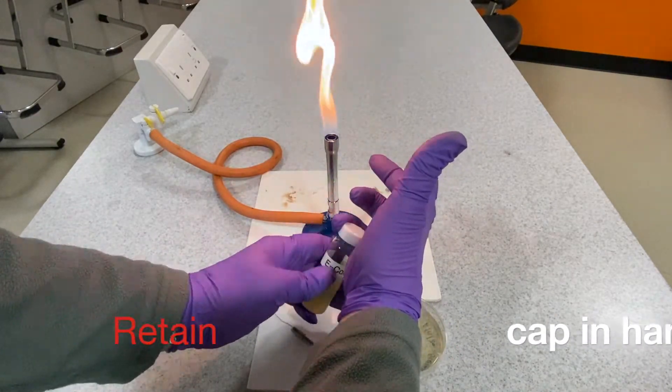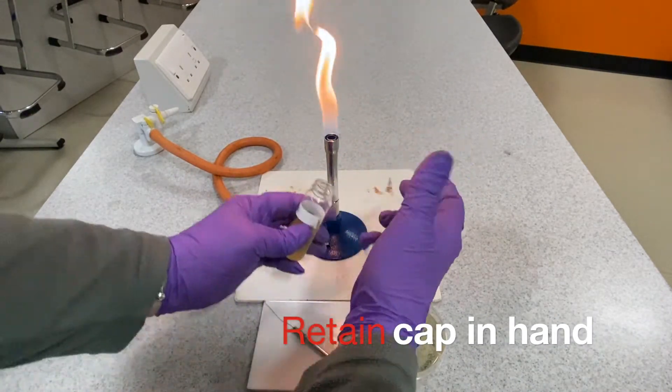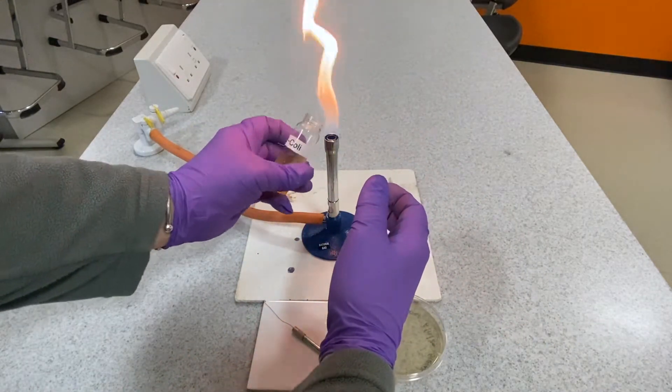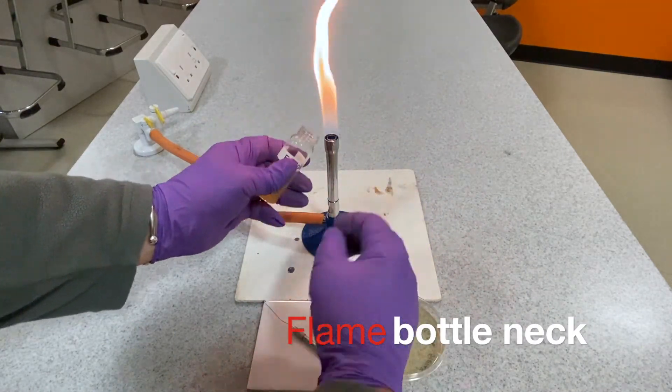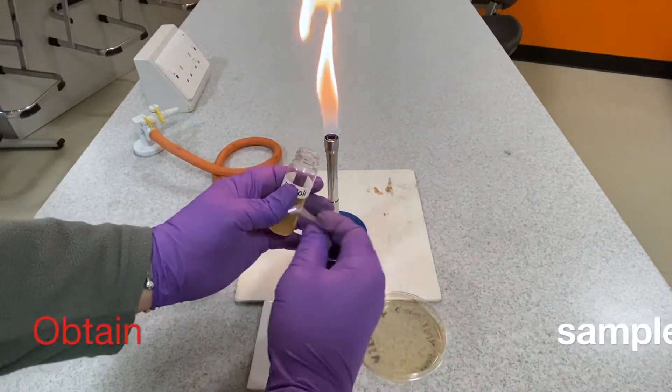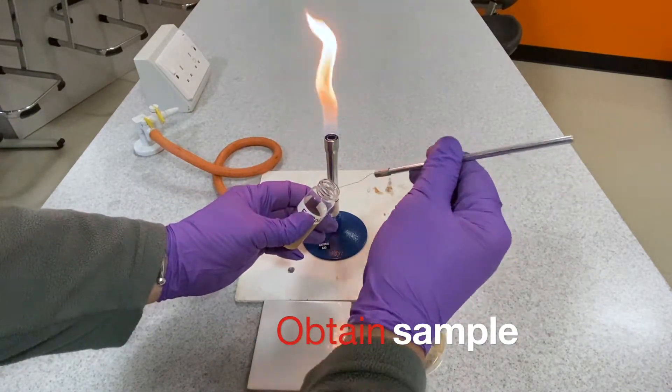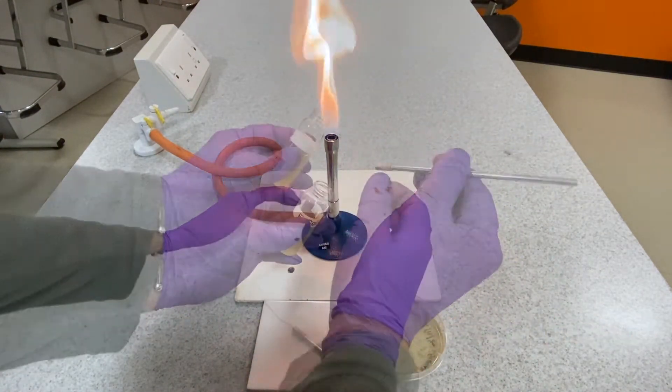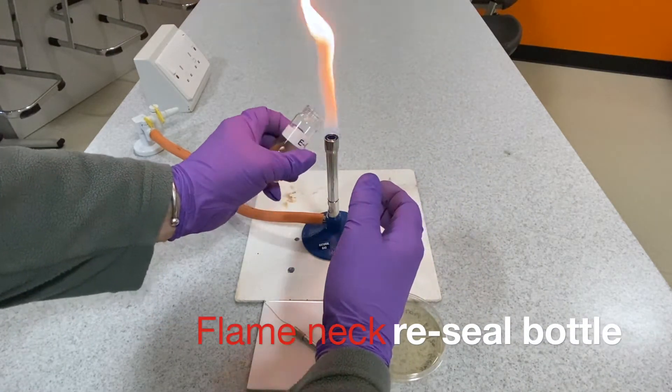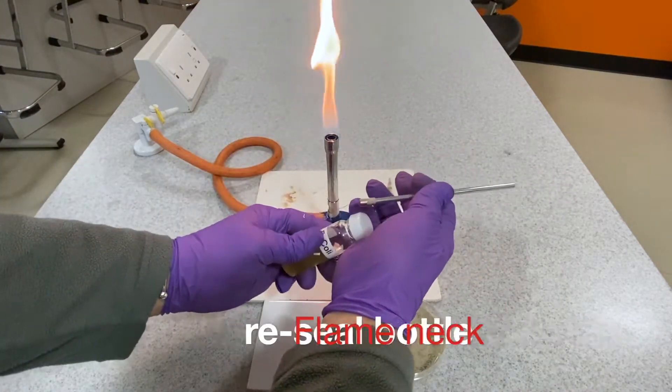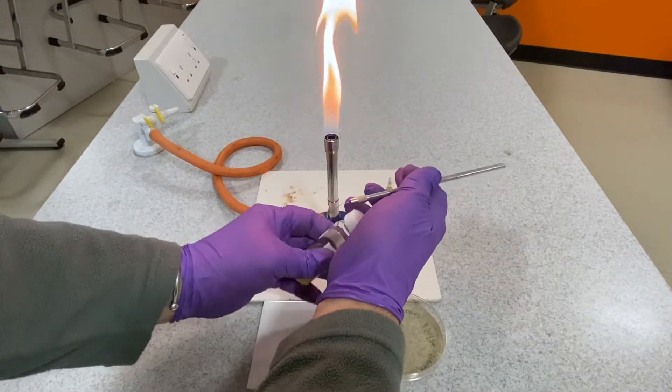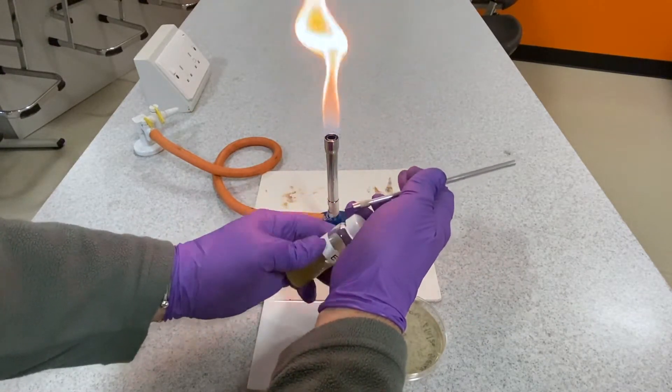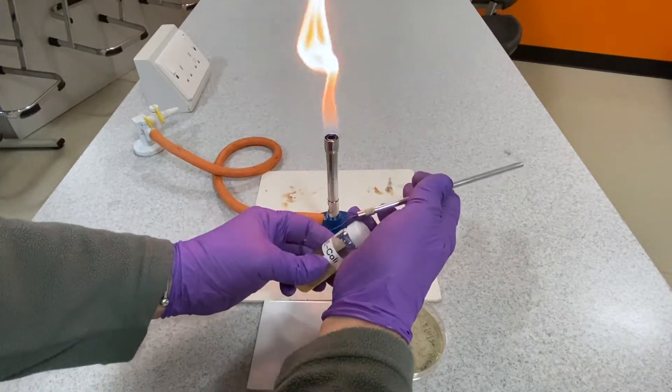Making a streak plate. From the bacteria culture sample bottle, remove the lid but retain it within your hand next to the little finger of your right hand. Flame the neck of the bottle, obtain a sample of bacteria using the sterilized wire loop, reflame the neck of the bottle and seal the bottle itself.